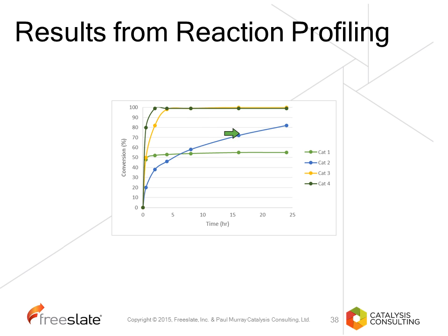And Catalyst 2 has a cost of $1,000 a kilo. So by taking more samples, we generate much more information and we can understand how this process is working. We also understand that this catalyst here has had something that poisoned it or has stalled for some other reason.